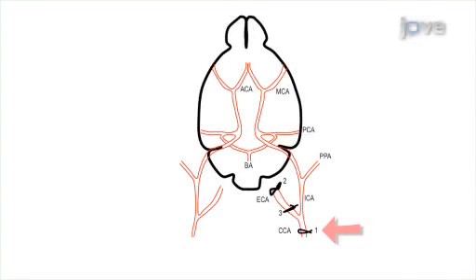First, the common carotid artery is temporarily ligated, whereas the external carotid artery is permanently ligated as distally as possible. Another temporary suture, slightly tight, is placed on the ECA above the bifurcation.